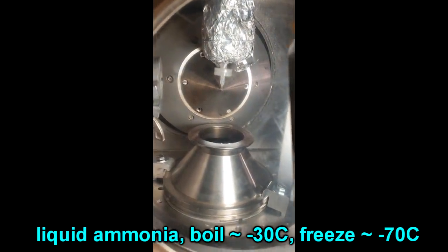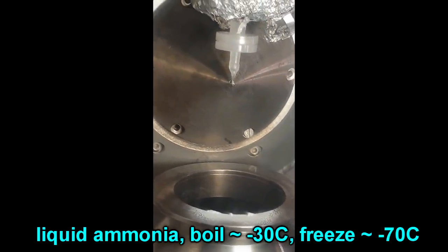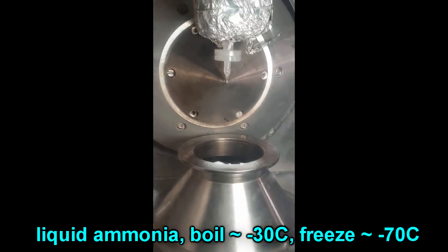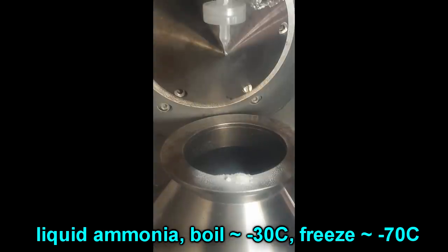So the microjet when it goes into the vacuum chamber it immediately starts to evaporate and to cool down. And there's a sort of little lag period before it actually freezes. So this is some of the weird stuff that liquid ammonia does in a vacuum chamber.